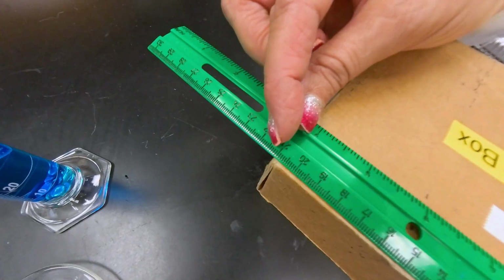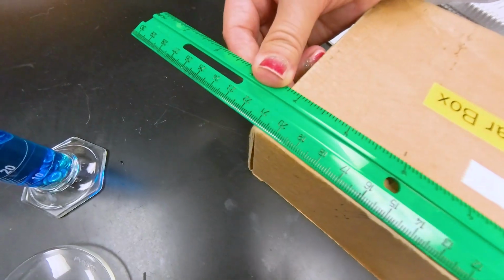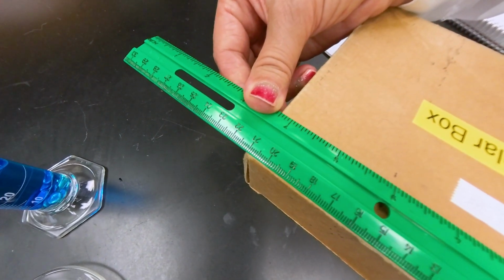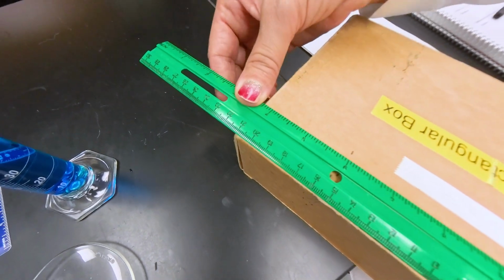If 0 is aligned at one corner, the other one is, to me, exactly at 21, and you can record that number as 21. You need 2 decimal places, so 21.00 in this case.